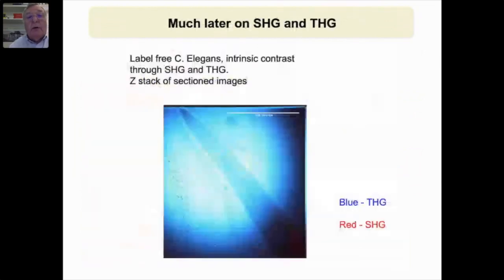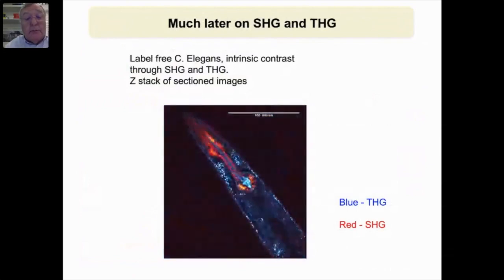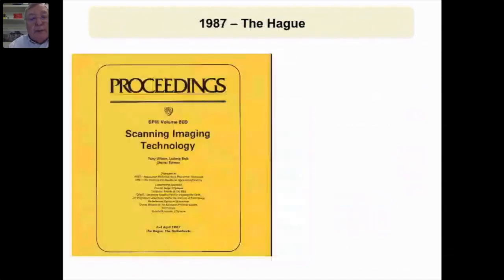A bit later on, we were able to do third harmonic and second harmonic. And here are third harmonic and second harmonic images focusing through a C. elegans nematode. Things have really improved rapidly.